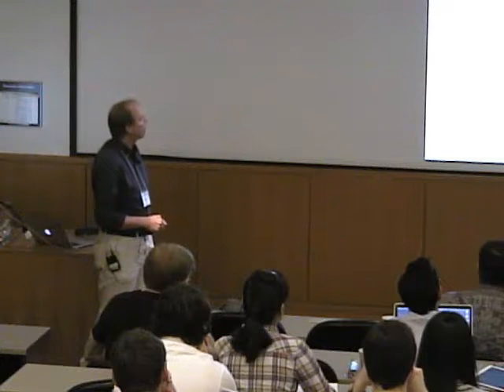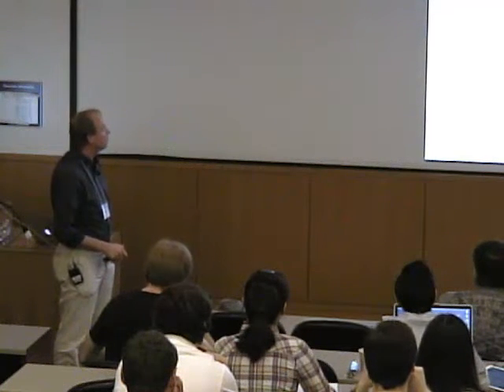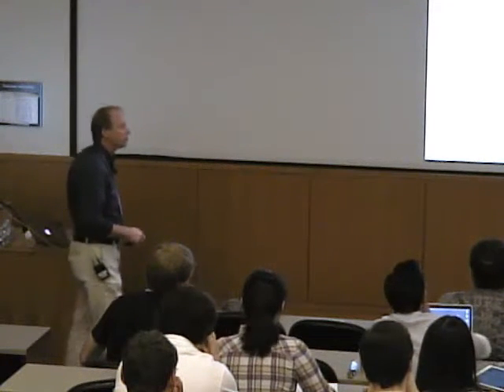So one thing that's a bit odd about EPR, so these are the frequencies that are typically used. There's a range of them. And one of the things that's a bit unusual about this is that each of these frequencies has an associated letter. And these letters have absolutely no meaning. They were originally developed actually in the Second World War and were a code that was intended to make it hard to tell which frequency was being used in radar, right? So there's no pattern at all to these letters, and you simply have to know what they are. But we still use them today routinely. Rather than saying what the frequency of the instrument is, we use this letter, right? And we refer to a frequency band. So there's L band and S band and X band and so on.